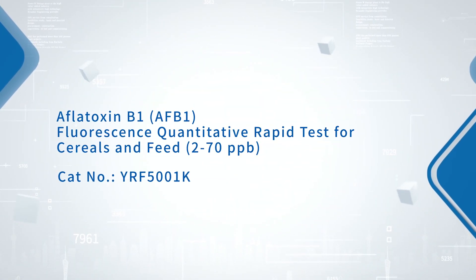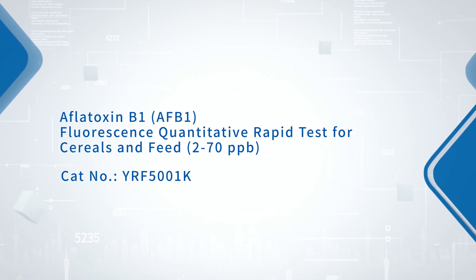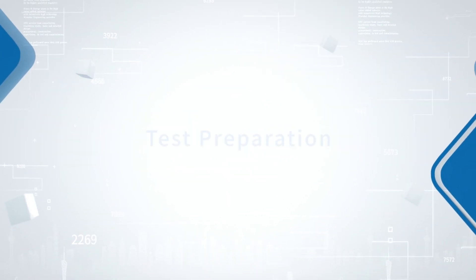Aflatoxin B1 fluorescence quantitative rapid test for cereals and feed — test preparation.